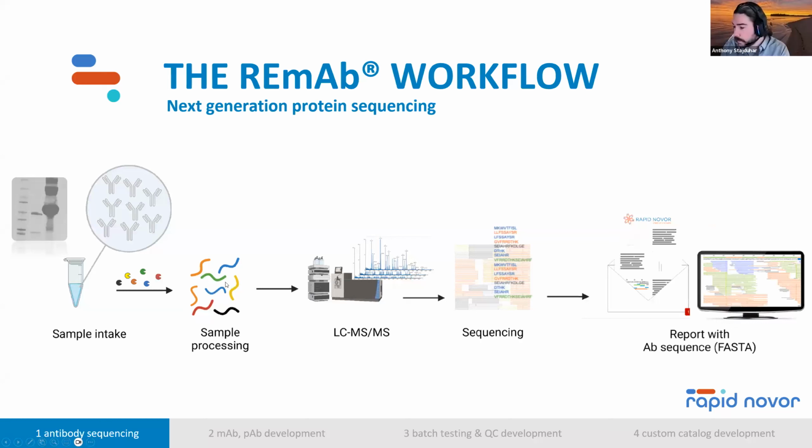Once we do our sample prep chemistry, we'll be injecting those samples onto the LC-MS system, and this system will output many spectra. Those spectra will be interpreted by our algorithm into sequences. And then once we have the many smaller peptide sequences, we can actually assemble them into a full-length contiguous heavy and light chain. In the case of a monoclonal antibody, it's not too challenging to imagine which ones pair together. I'll get into the polyclonal side in a moment. But once we have those prospective chain sequences, we put them into the report for you to interpret and read, and perhaps contact evitria to express.